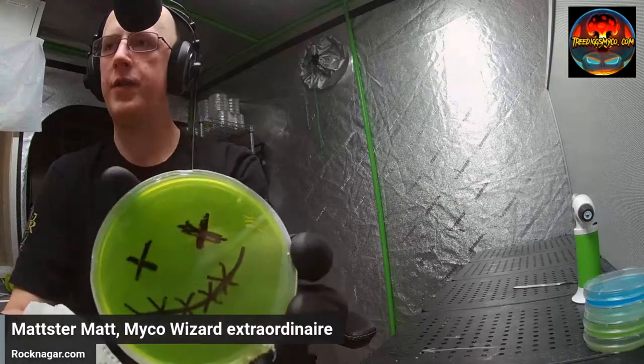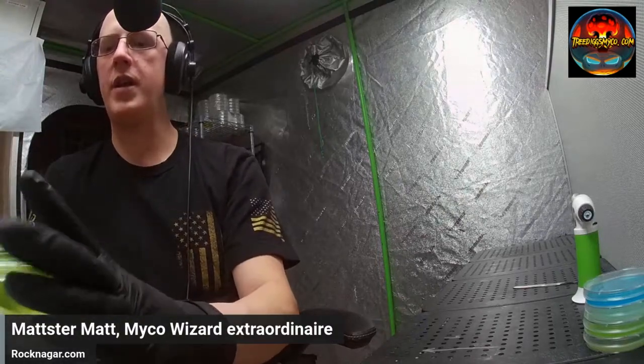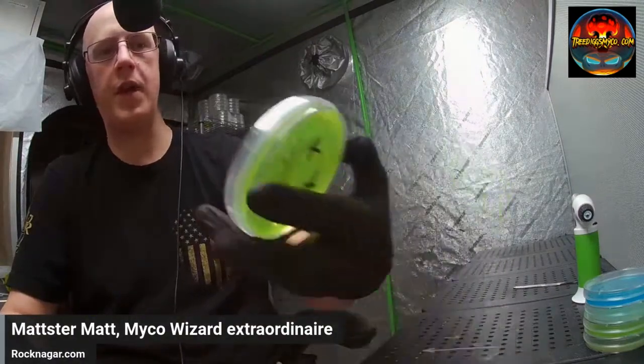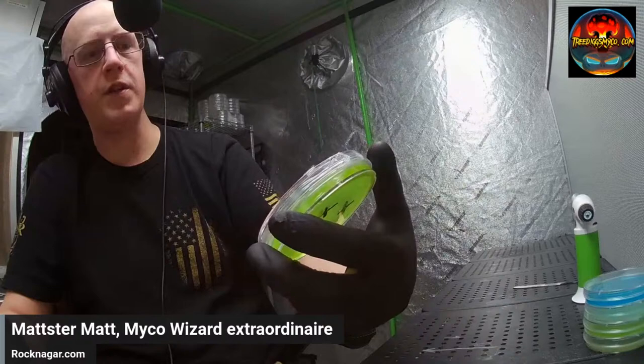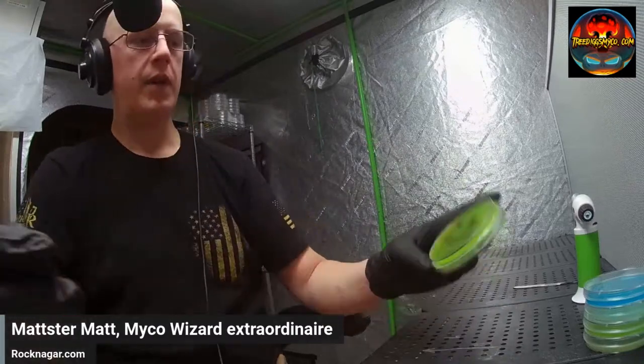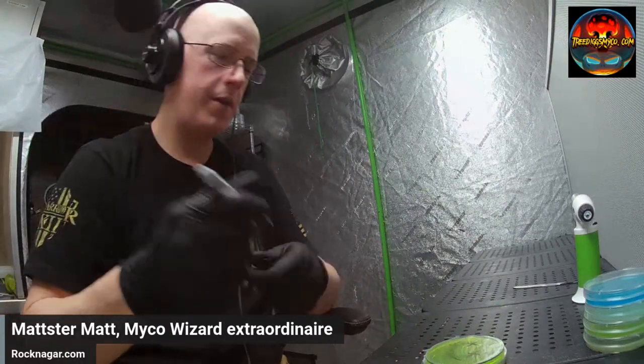Now, the key thing when you're sanitizing your plate is that it is wet, so you do have to be kind of careful. It will kind of mess up, so you've got to have an imagination there. Or like me, I will go back now that it's mostly sanitary and take my Sharpie.